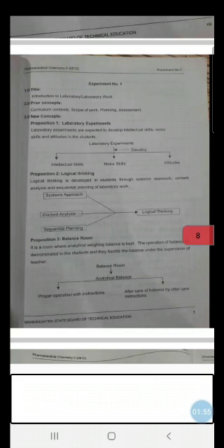the year. Now, when you are in your chemistry laboratory, you have seen that there are two doors. These two doors are essential for safety purpose, for easy evacuation in case of emergency, and for ventilation, proper lighting, etc. Your overall chemistry laboratory we can divide into 4 parts. One is the chemical storage and preparation room. Just attached to that is your balance room. Then a large area which we call the working area where platforms are there, and a fuming chamber or fuming cupboard.